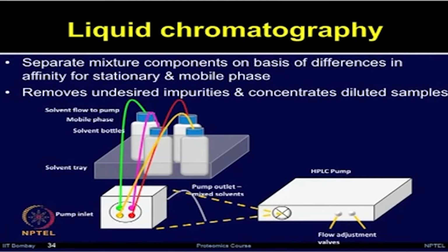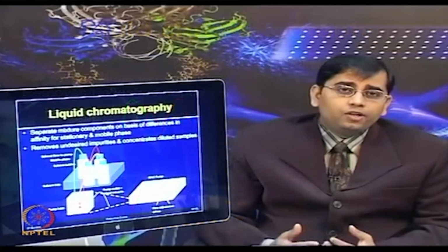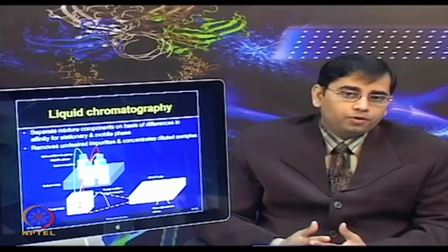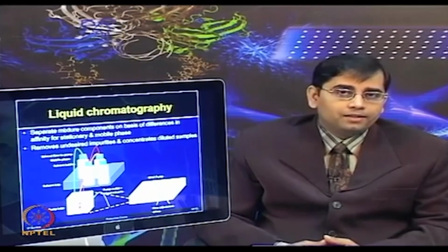One of the diagrams is shown here, which is a typical liquid chromatography setup, which consists of solvent bottles, degasifiers, dual or quaternary pumps, the sample injector, column and detectors. Different solvents can be placed in the solvent bottles depending upon the purification requirements.